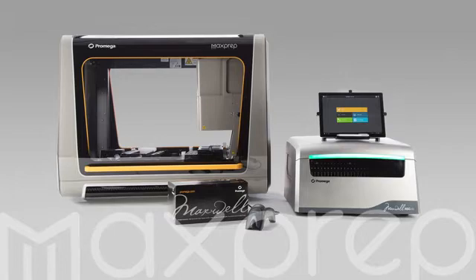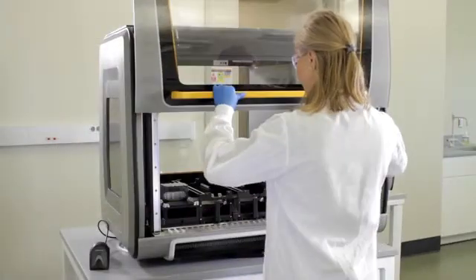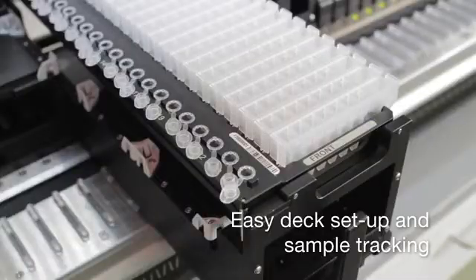The MaxPrep Liquid Handler automates sample processing and prepares Maxwell cartridges for nucleic acid extraction. The instrument also performs post-extraction sample handling tasks like adding quantitation dye, normalizing samples, and PCR reaction setup.